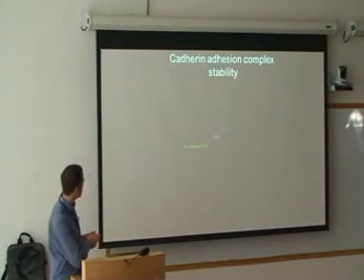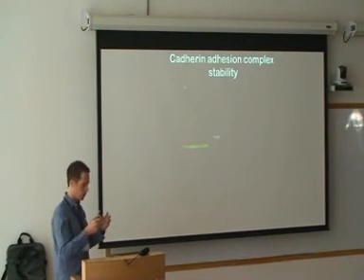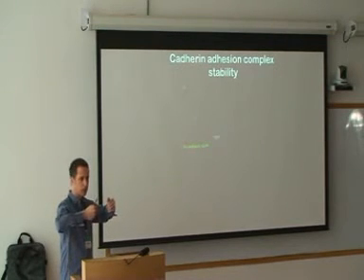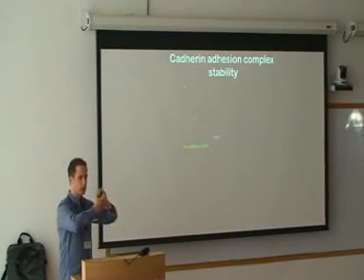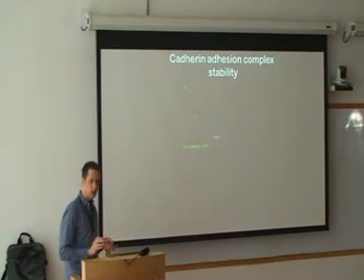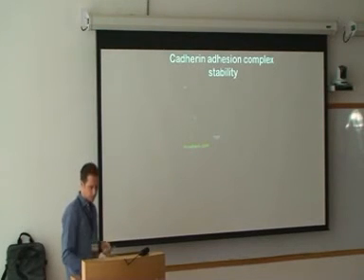Okay, what we're expressing here is a GFP-coupled cadherin. These are two cells, with cadherins localized at the cell-cell contact. We're pulling them apart. What you find is there's one cell, there's another cell which you can't see. There's a plasma membrane tether connecting these two cells when you pull them apart. And all GFP cadherins at the cell-cell contact flow into this tether. So you're pulling on the adhesion complex, and what is happening is that the cadherins rupture from the actomyosin cytoskeleton and flow into a plasma membrane tether connecting the two separated cells, not fully separated cells. So the link between cadherin and cadherin is fairly strong. You don't break that very easily.